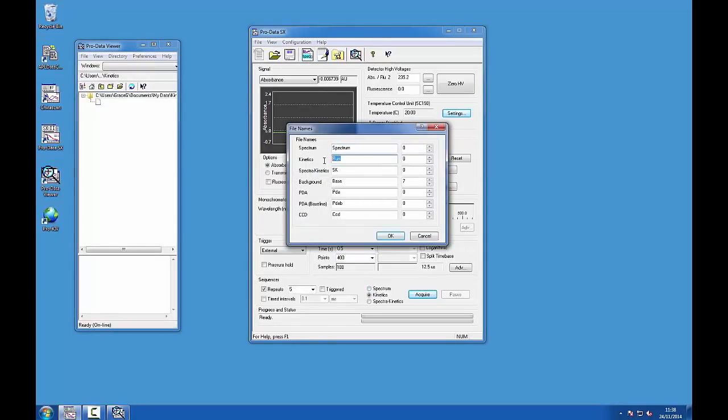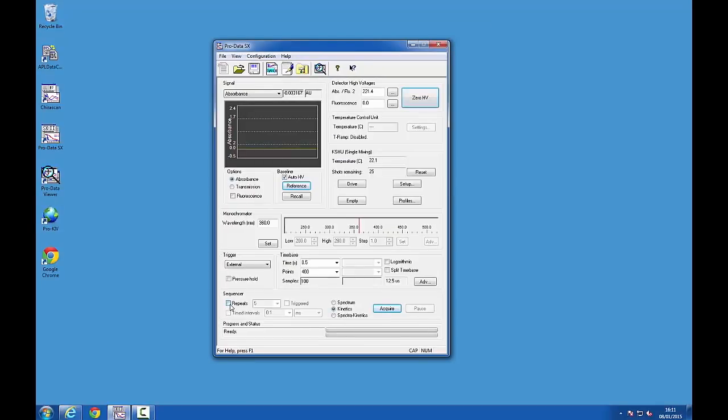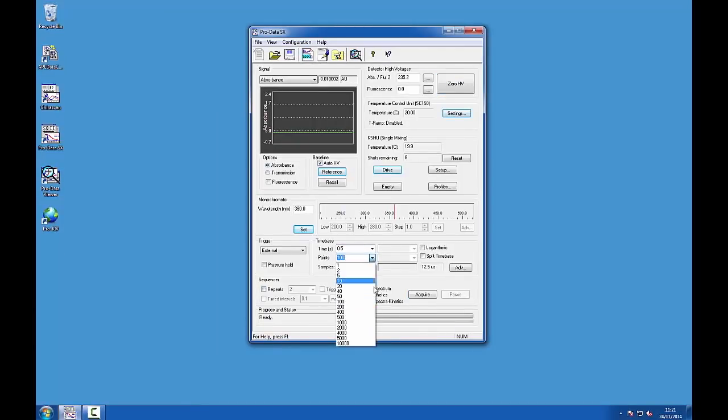Enter a name for your results file in the file names dialog window. If you want to measure repeat drives, set the number of repeats to your desired value. The number of points should normally be set to a value between 400 and 1000.